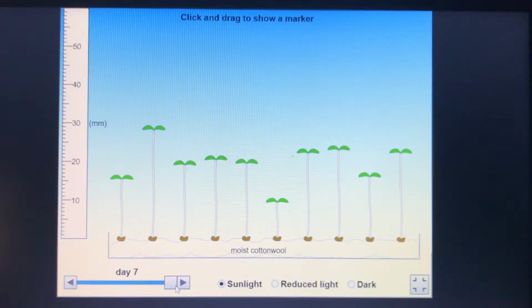reliable my results are. And we can link this back to the quadrat sampling, where if we've got a big field and we're trying to sample that area, we're not just going to do 3 quadrats, we do at least 10, and it gives us a greater chance of getting a good representation of what that field looks like. Because if I only do 3 quadrats, I may well miss an entire plant species from the field. And in this situation, if we only had, say for example, these first 3 seedlings, they're quite varied in their heights, and it's not giving very reliable data.